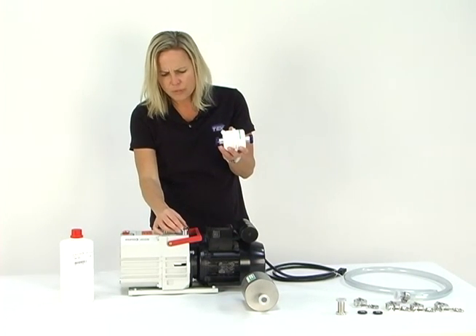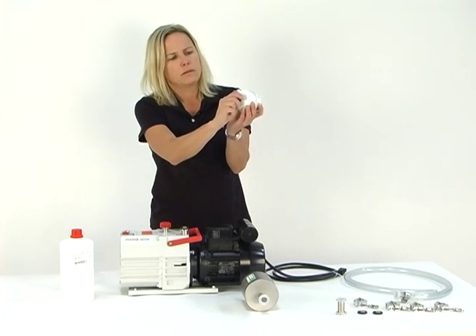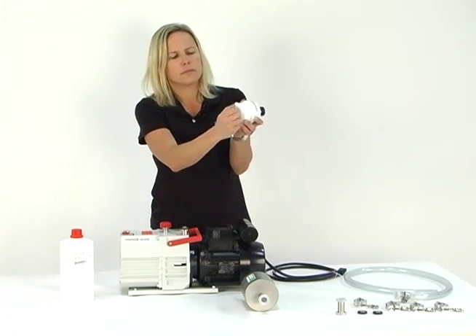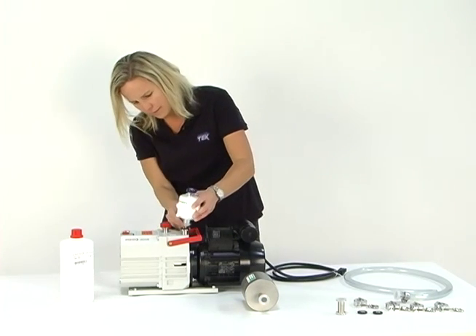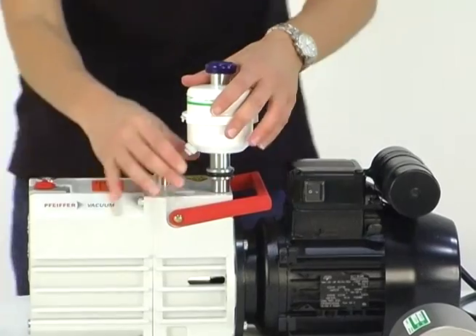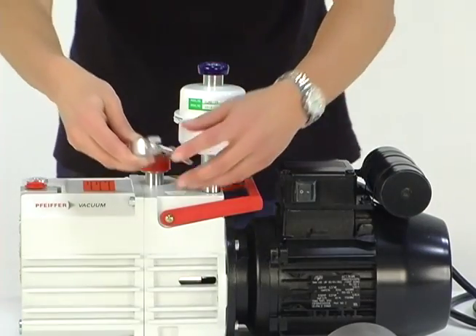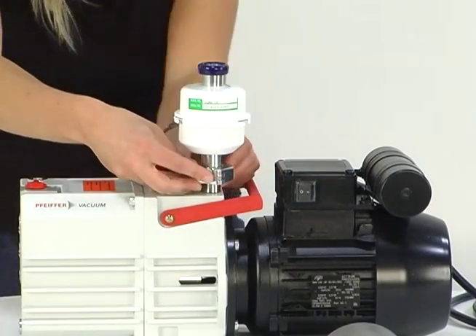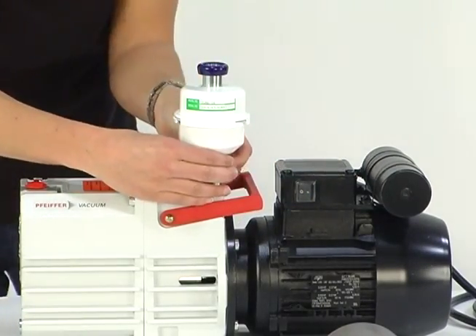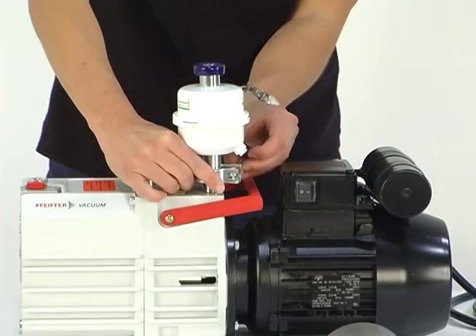You'll see a Viton O-ring screen in here. Pull off the protective cap on the mist eliminator and set the two together. Now I'm going to clamp the mist eliminator onto the pump exhaust. I wrap this clamp around, pinch it, and tighten this wing nut.